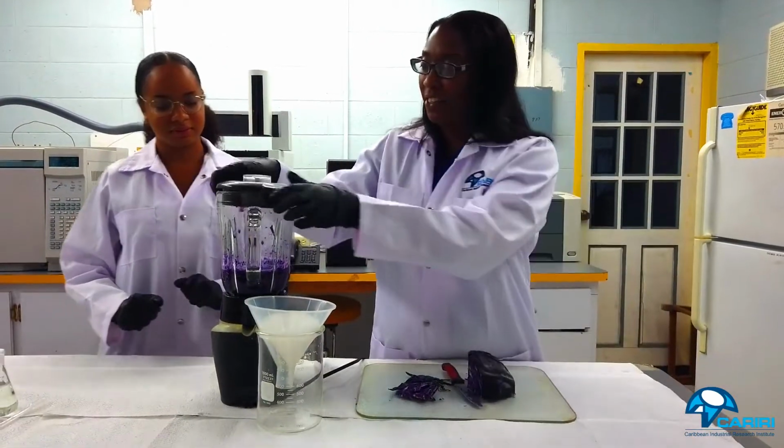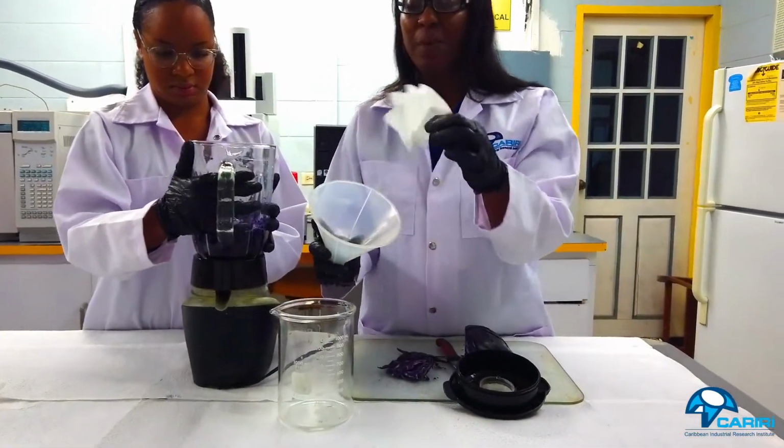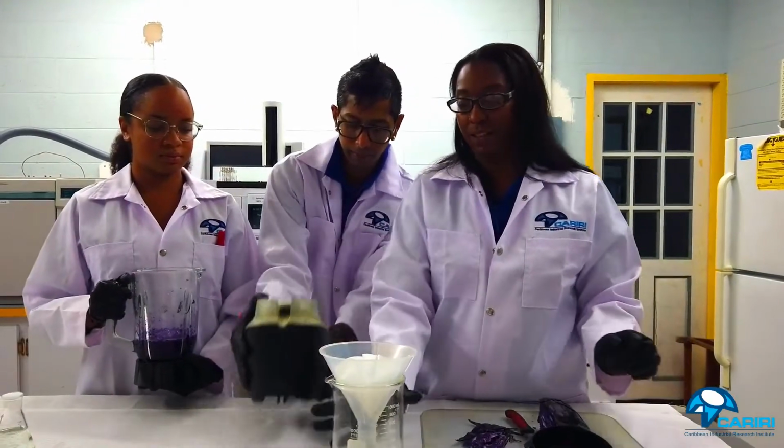Okay, so we're going to filter this. And here we have a funnel and a beaker with filter paper. Now you may not have access to filter paper at home, so you can use a strainer, or if you have coffee filters, you can use that as well.